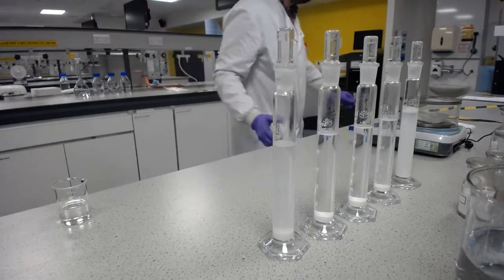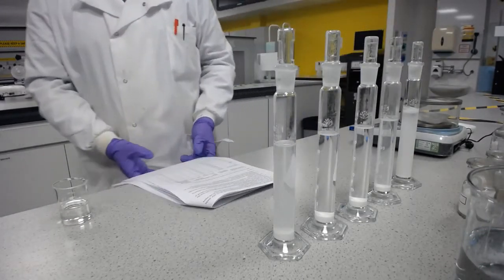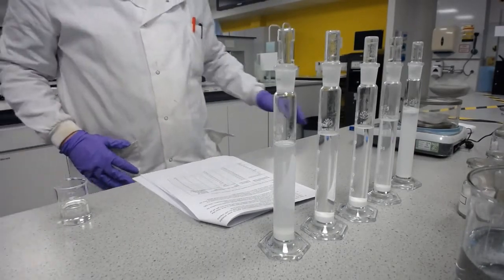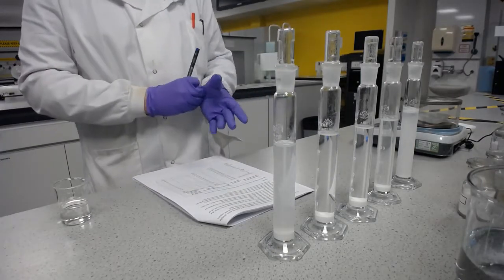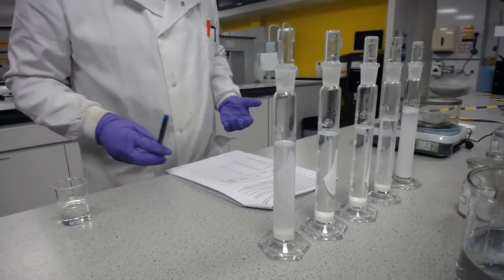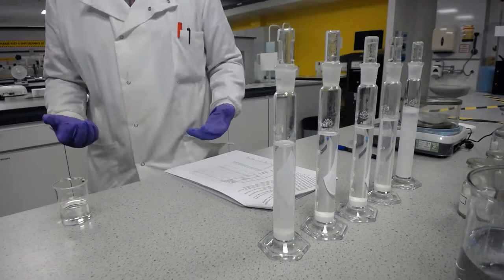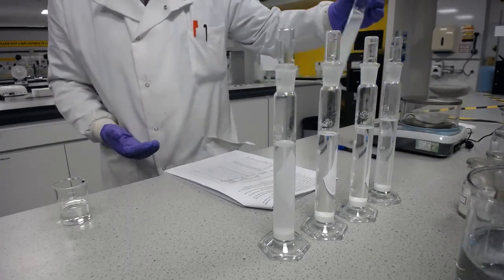Now, just to finish off this first part of the lab, after having had the solutions sit for a prolonged period of time, we need to then have a look at how many inversions are required to redisperse properly each of them. And really, this is the most important part, because as we said, it doesn't really matter if it splits. What matters is if it cakes. And so we'll go through all of them. So the first one here with water.